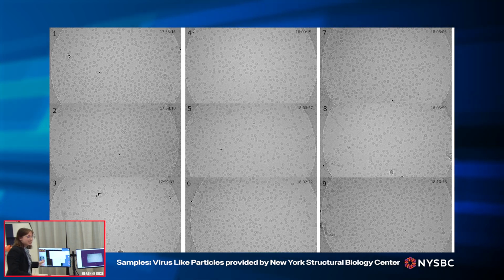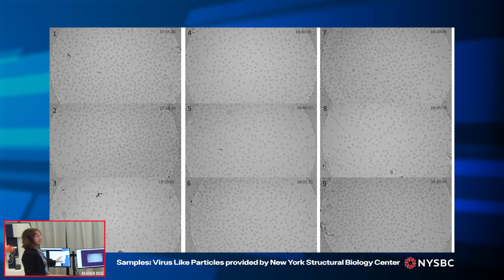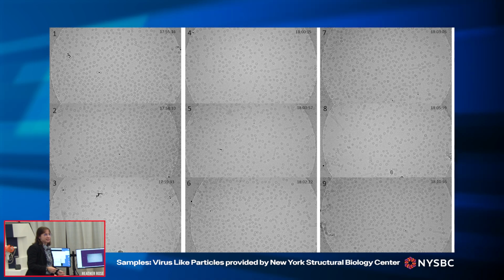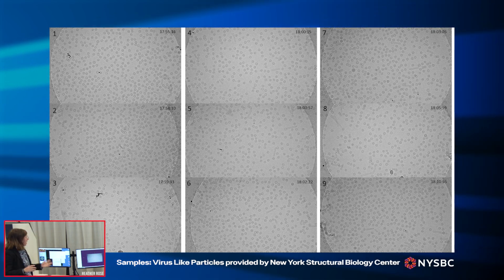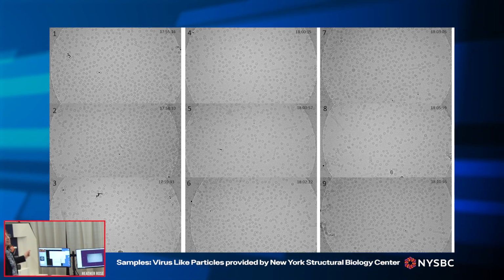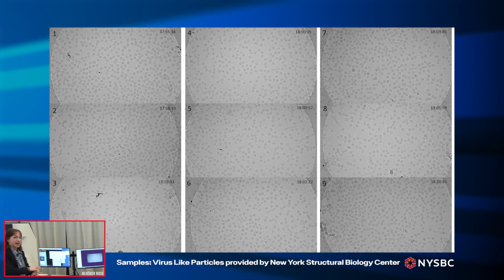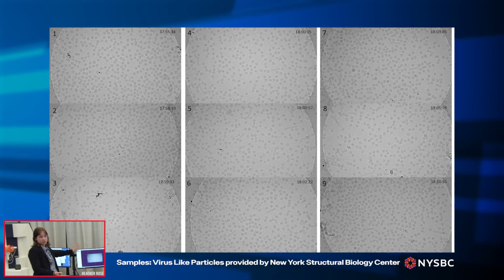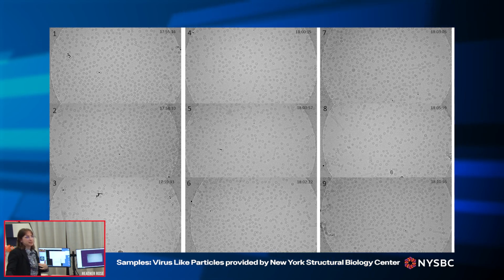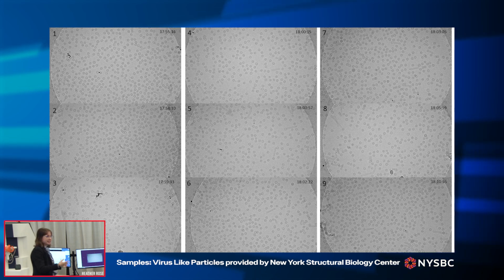So having a system that can do this cryo screening, especially as a thermionic and not needing a field emission, I can do much more with this tool, get an idea of what my particle looks like, and utilize national labs across the country that have maybe 200 or 300 kilovolt systems. So I don't have to look at field emission systems. I can look at a thermionic for screening and then utilize these national lab facilities to do the full reconstruction. If you're not familiar with how the national labs work, some of them do require that you have screened your particle so that when they spend their time and resources on the more expensive tools, they know what your particle looks like beforehand. So it's a prerequisite to get your image as a data collection.